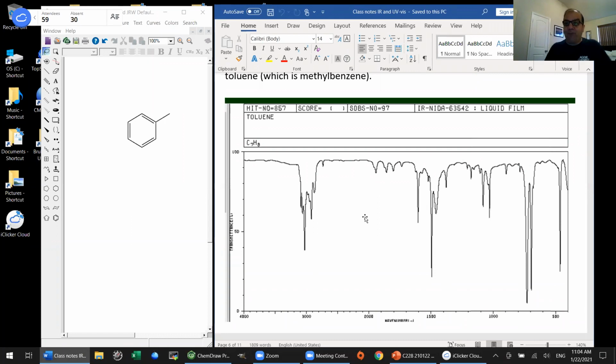And again, don't take my word for it. Look up a bunch of aromatic compounds. That will show you what the variations are in that pattern that you can expect. But we talked about patterns the first day of class. So that there is, I believe, a pattern you can trust. If you have an aromatic compound, you will see a few of these overtone bands. If you want to get an idea of possible variations within that pattern, the very best thing you can do is to look up spectra yourself. There's no list of rules that I can give you, even if I could come up with it, which I doubt, that would do you 1% as much good as just going and looking up spectra.